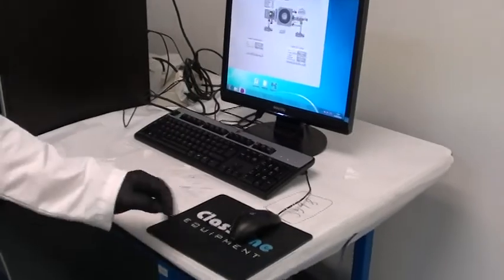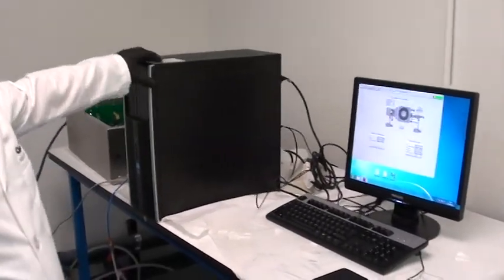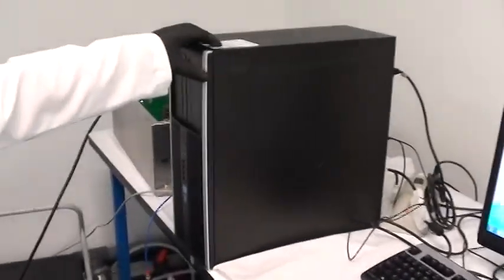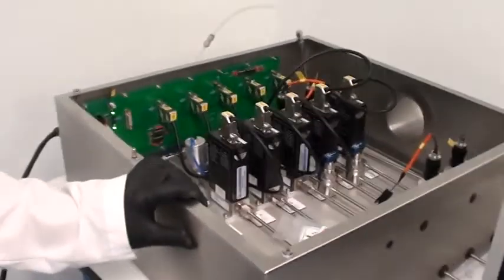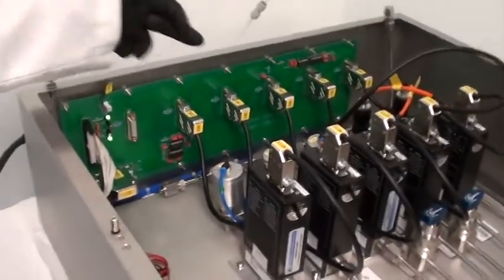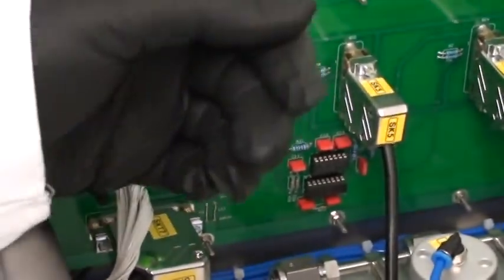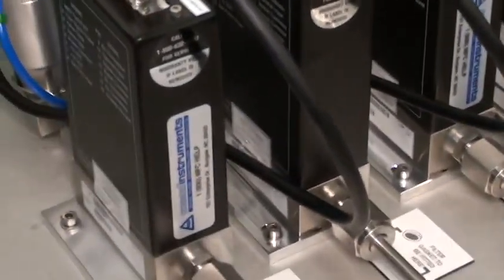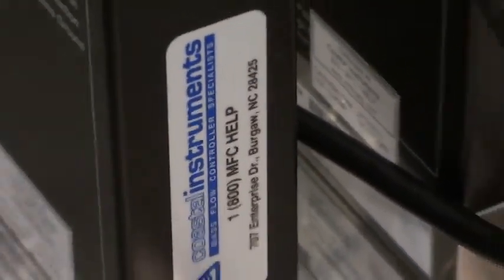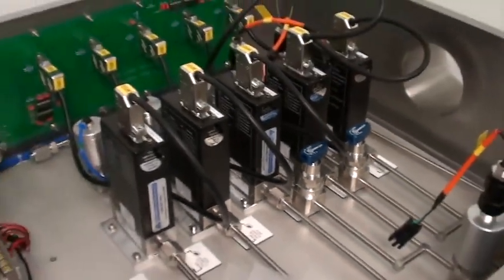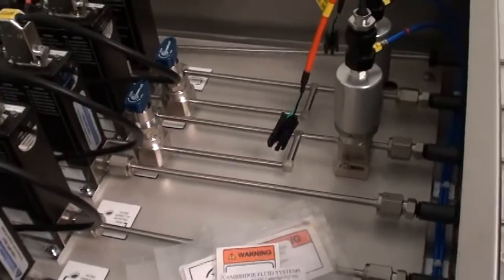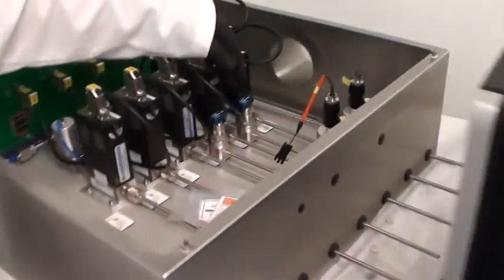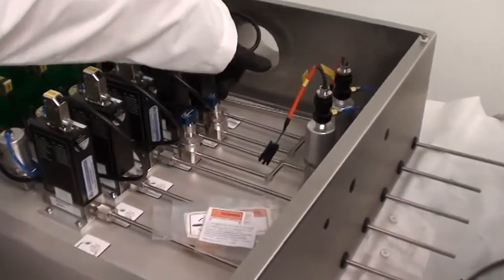We have new monitor, keyboard, mouse. Brand new computer from Oxford with brand new up-to-date software. Brand new gas box with brand new control. MFCs have all been sent out for cleaning, calibration. The gas box has been thoroughly tested. The gas control has been thoroughly tested. All toxic or corrosive gases will have bypass plumbing.